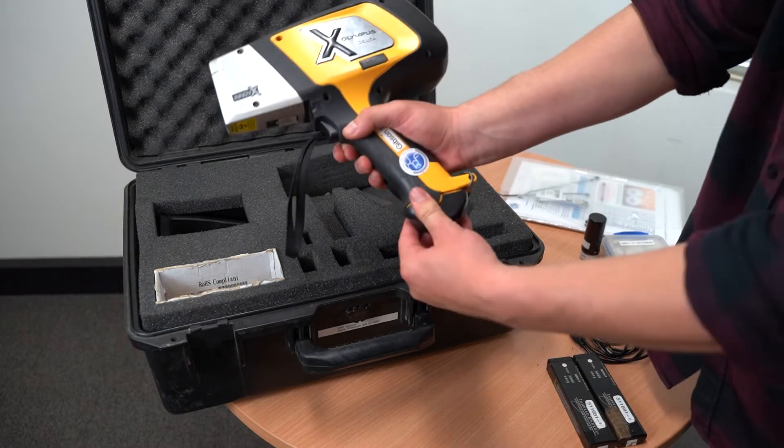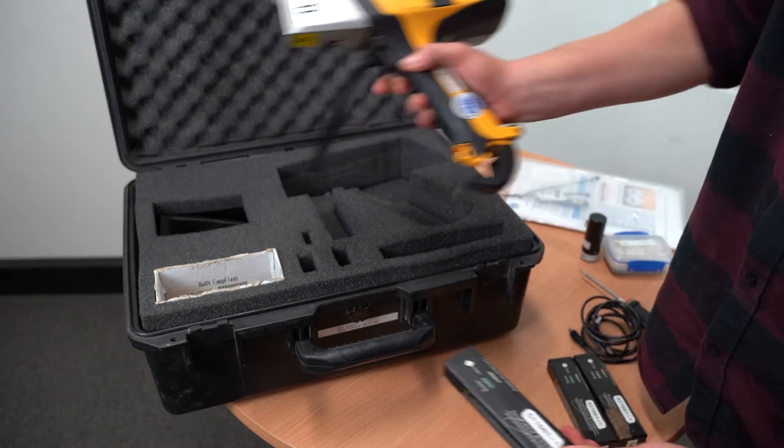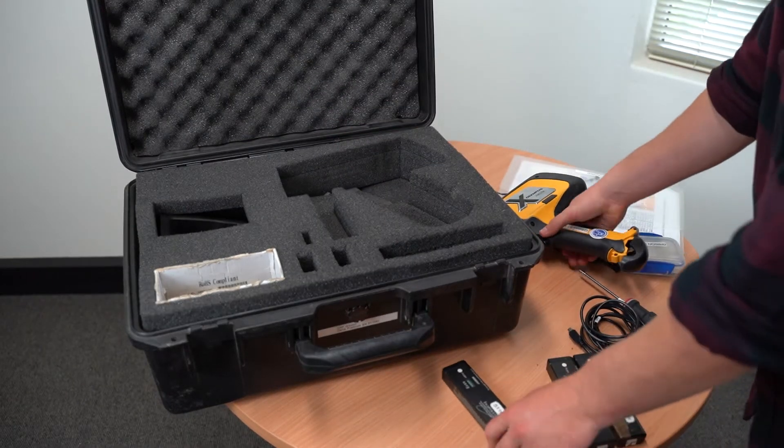The first step is to remove the battery from the instrument. This is to ensure you're practicing radiation safety.